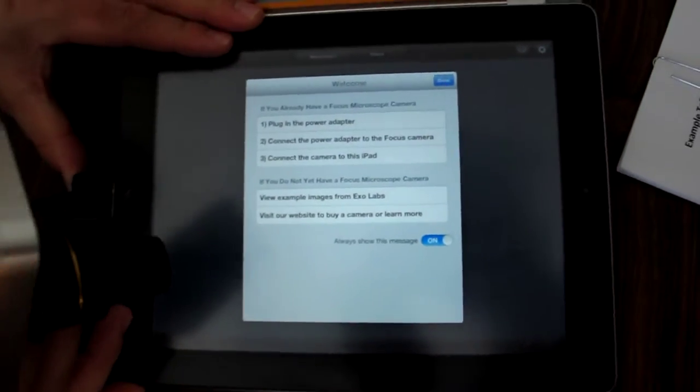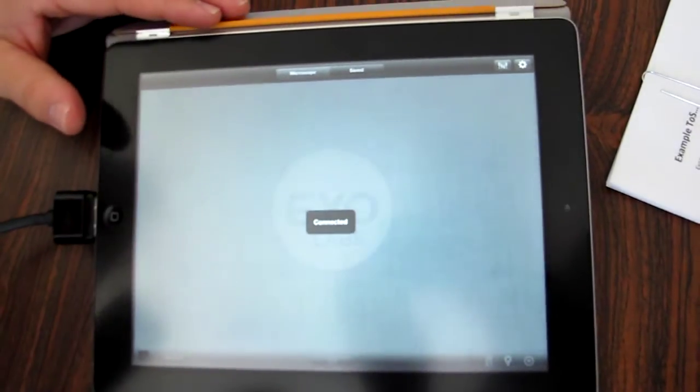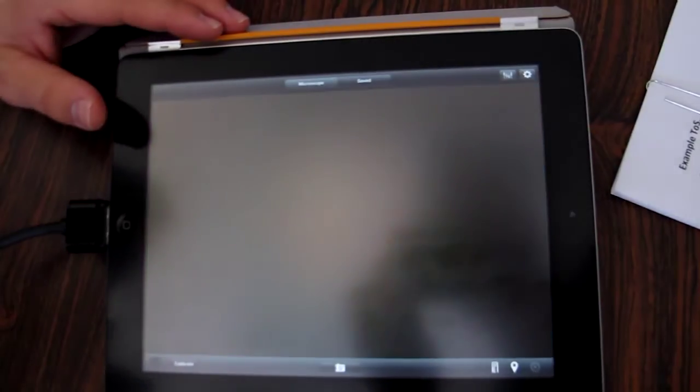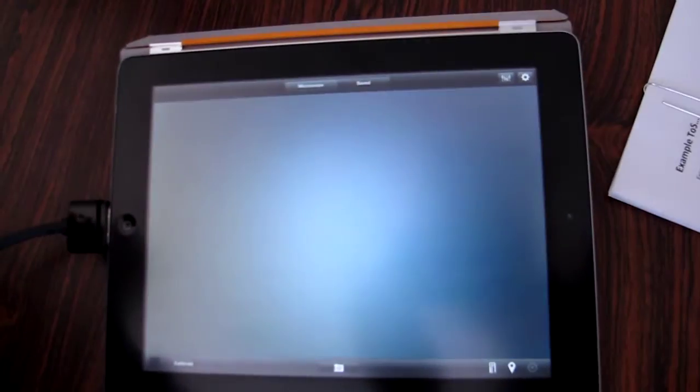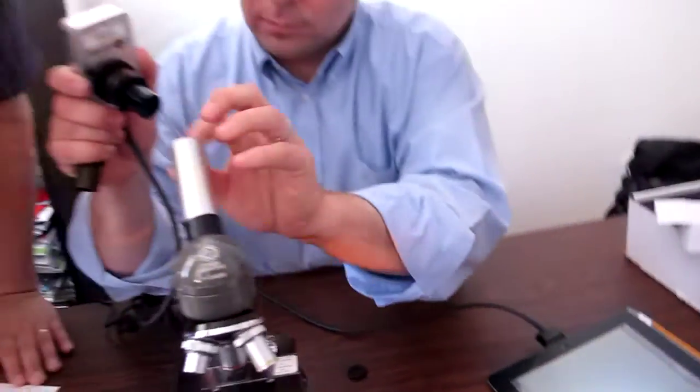We'll plug her back in and, oh, connecting. That's good. Oh look at that. So now this is a 10x eyepiece on there. So now does it have to work with... Oh look at this.